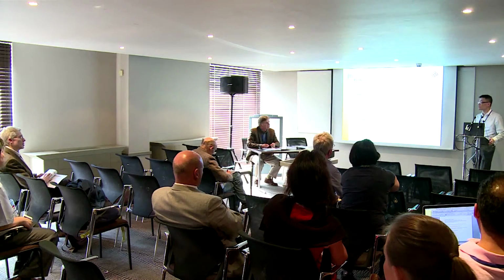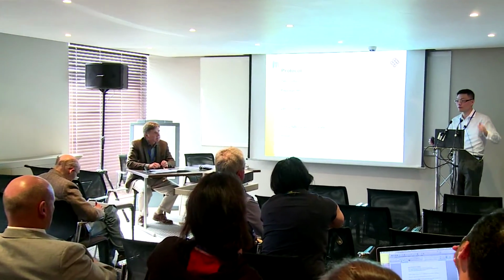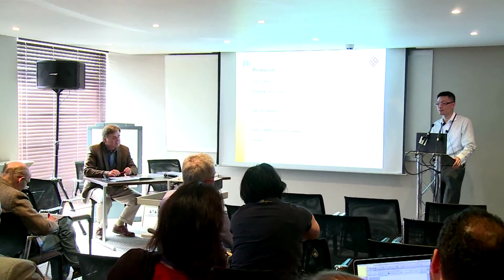Also, the software allows us to remove the background. This is very suitable for high throughput screening. Very good to see. Also, later on we are purchasing a single molecule imaging system. It is based on total internal reflection technology, and this kind of problem can be solved and is more specific when using that kind of microscope.